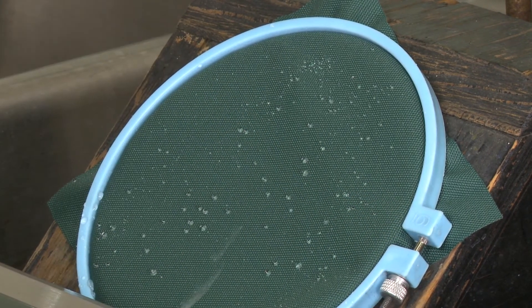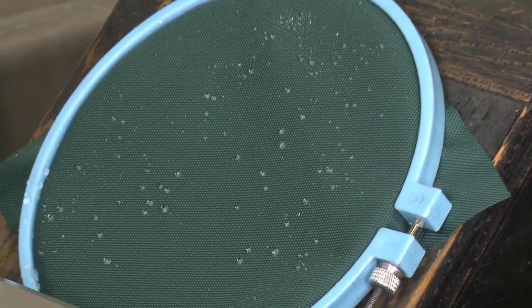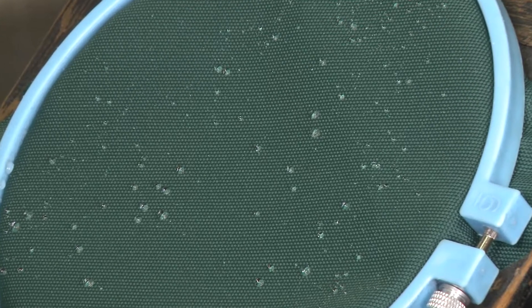The fabric is then visually inspected for wet spots and compared to a chart. This particular fabric equates to a spray rating of 100. The fabric is the perfect color.